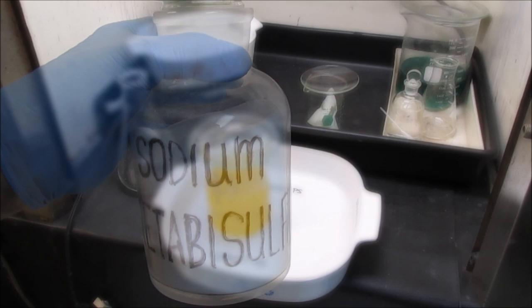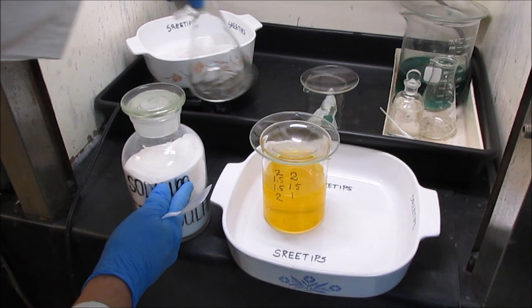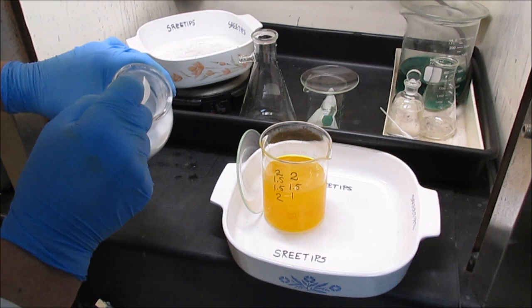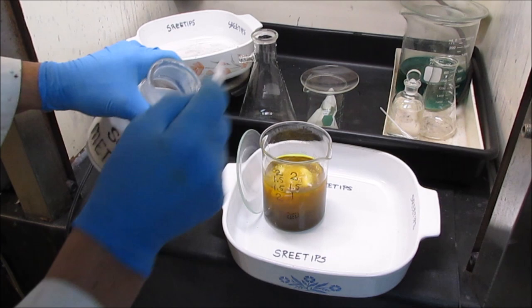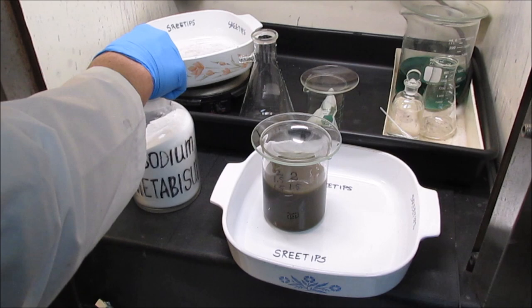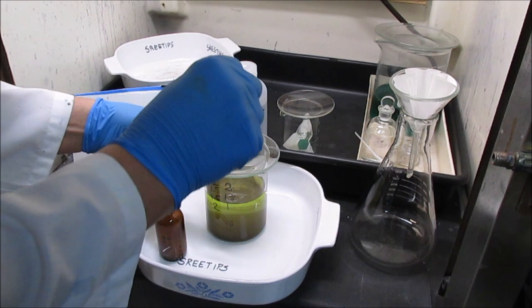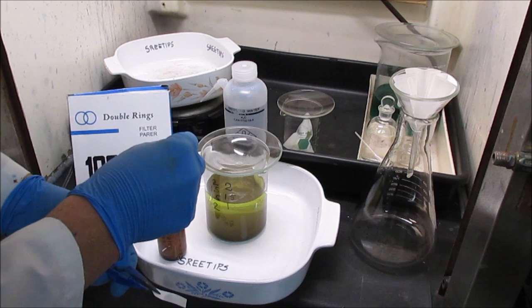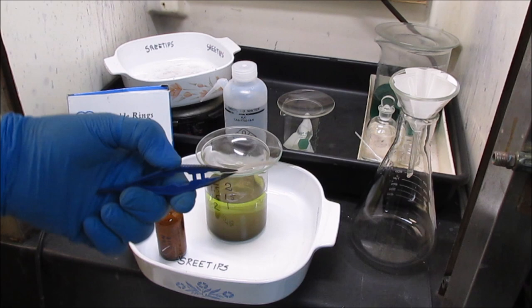I'll use some sodium metabisulfite, drop that gold out of the solution there. Came right on out of solution nicely. That should do it. Gold settled very quickly. It's still got a little bit of a yellow color to it, so what I'm going to do is put some stannous on here and see what we got in solution. And the stannous test indicates nothing. No precious metals.